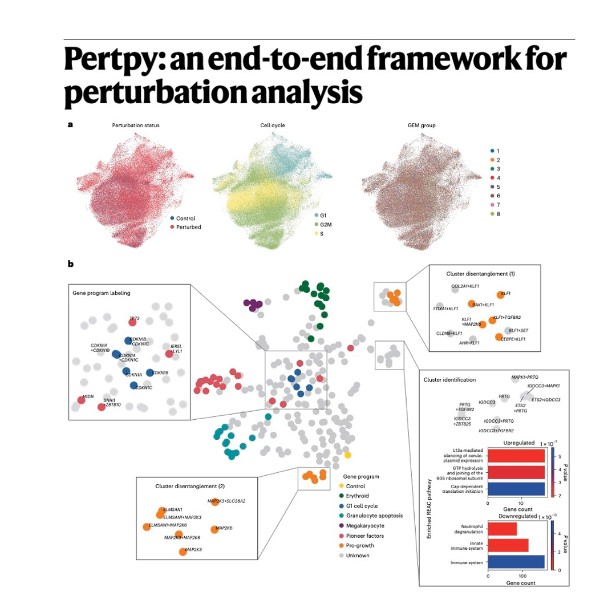I like that. An avatar. And that avatar becomes a single point in this new perturbation space. And so perturbations that do similar things to cells will naturally cluster together in this space. So how do you calculate that avatar? What's the method? Well, one really powerful approach is the multilayer perceptron, MLP, classifier space. Pertpy trains a neural network to predict which perturbation was applied to each cell. Okay, so it learns to tell the difference between drug X and drug Y. Exactly, but here's the clever part.